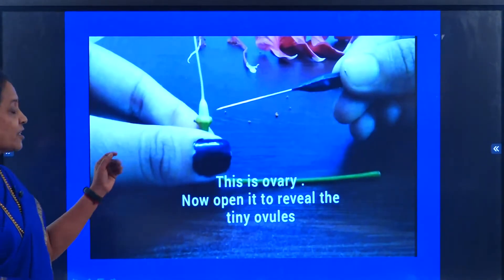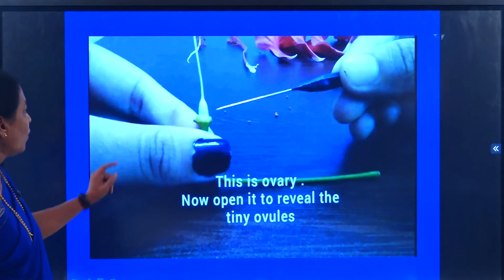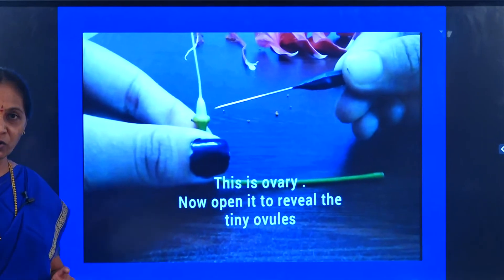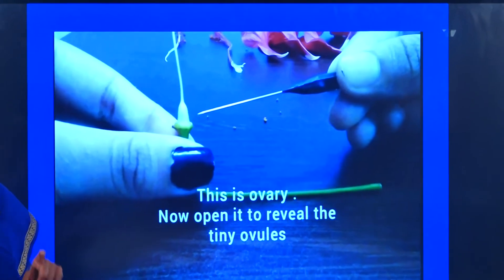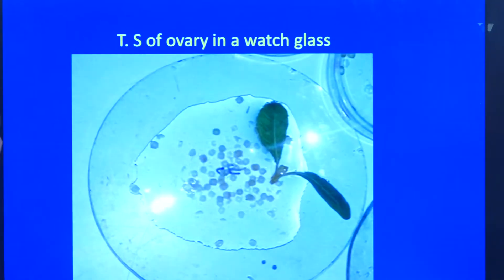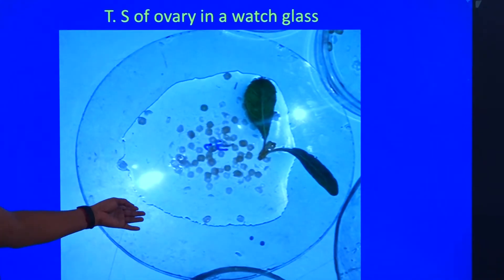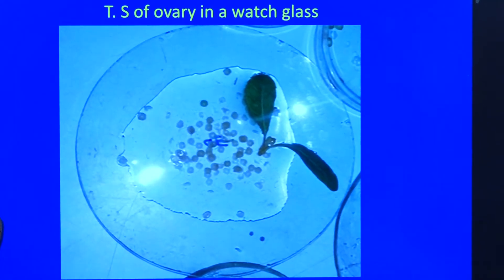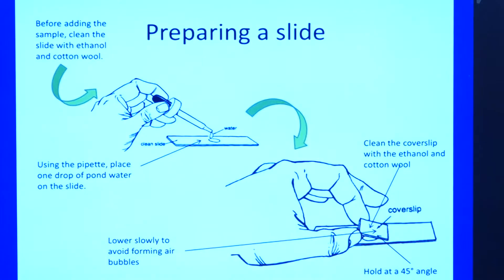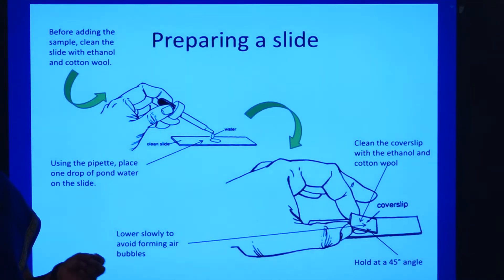This is the ovary. When we observe the gynoecium, it will have the ovary, the style, and stigma — these constitute the gynoecium. We are going to take the section of the ovary. When we take a section of the ovary, it appears like this in a petri plate or a watch glass. This is how we are going to mount the sections.